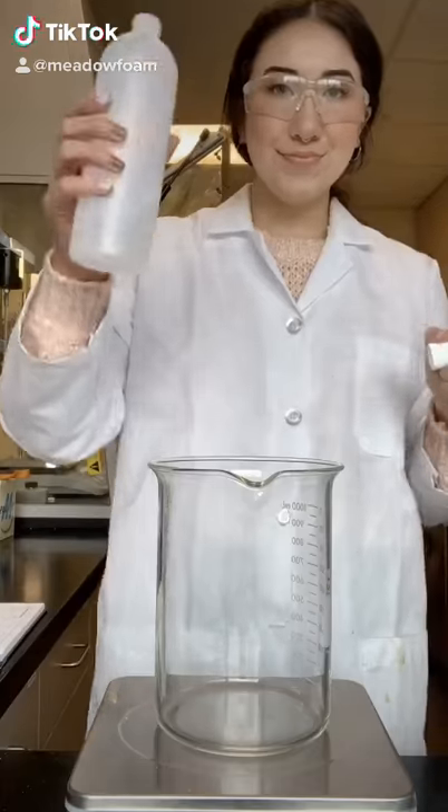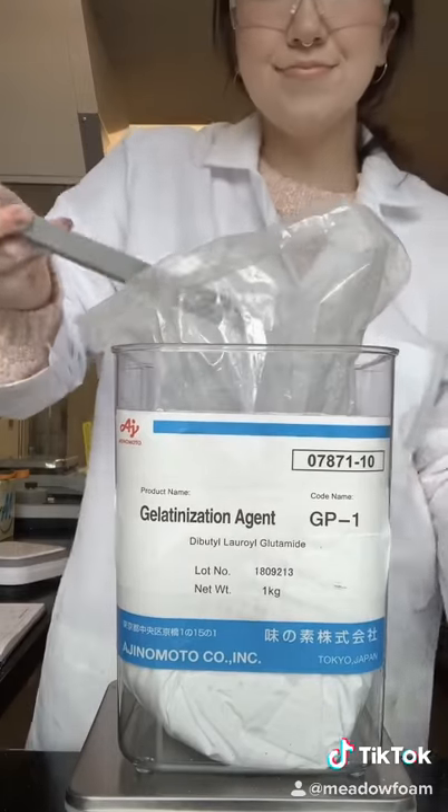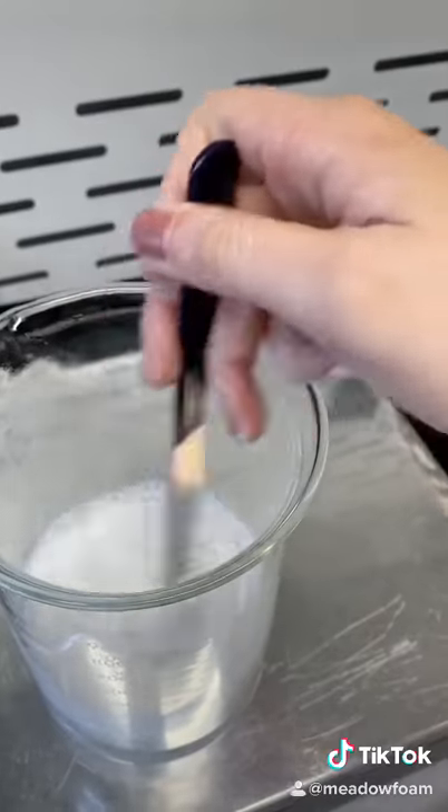Today I'm making a batch of our clear oil sunscreen stick. We start out with octildodecanol, which is a solvent used for our gelling agents that turn liquid oils into solid gel. They take really high heat to dissolve, so I get these right onto the hot plate.